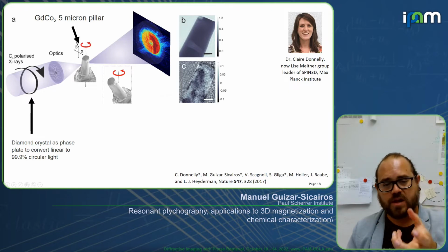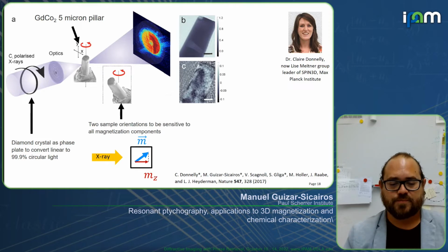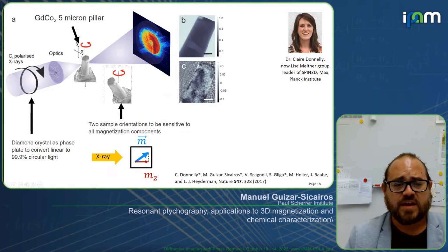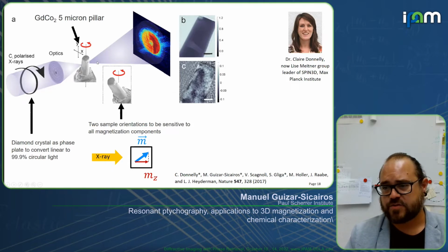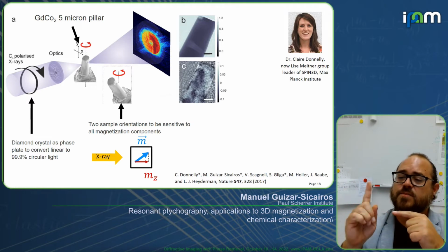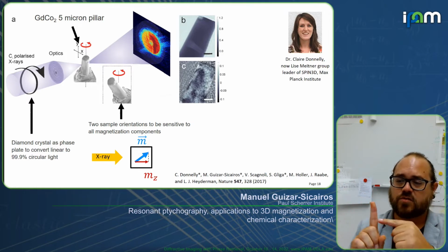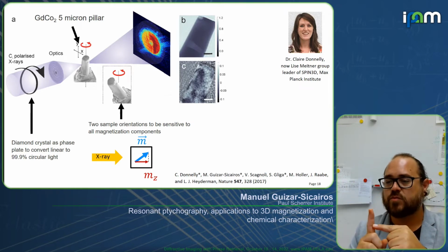First, we measure it with normal tomography, and this is something that John also touched upon. If you notice, we are only going to sense magnetization in the direction of the beam propagation. So if we rotate perpendicular to the beam propagation, then the magnetization along the y direction, parallel to the rotation axis, we will never be able to probe.